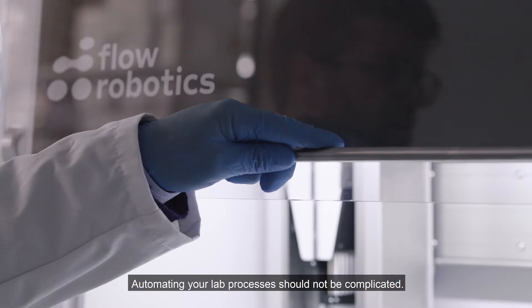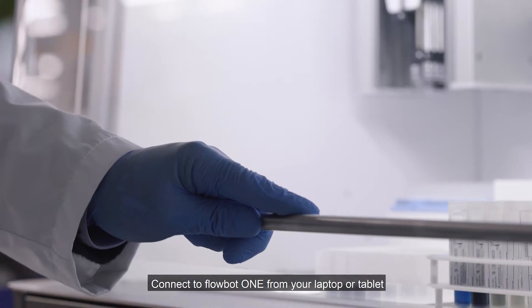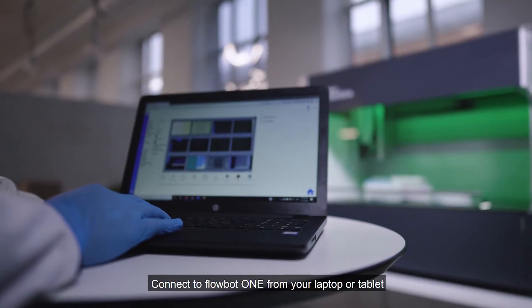Automating your lab processes should not be complicated. Connect to FlowBot 1 from your laptop or tablet.